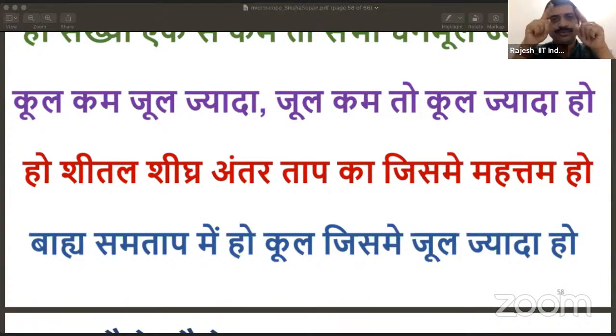So in earlier technology, a filament of tungsten was used. It was heated and a voltage was applied, then these electrons move from the tip and are taken away by this voltage. That's how the electron beam is created. Okay, is that okay, Jaydeep?